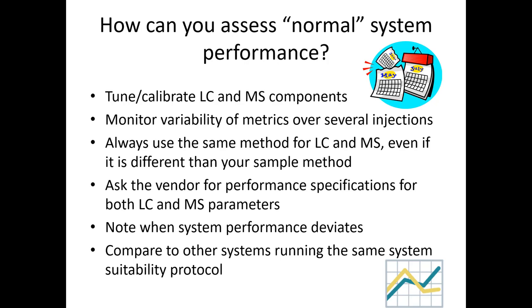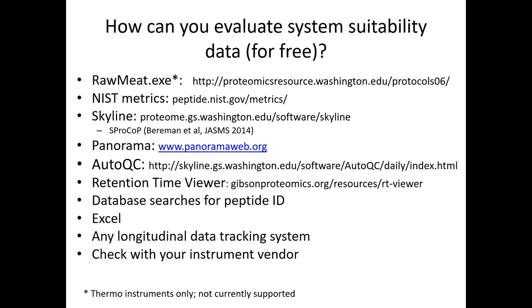And again, who here runs a Q Exactive HF? Okay, look at each other, talk to each other later about what system suitability stuff you've run, and then go back home to your labs and run them, and then talk to each other and ask, what did you get? Because you should be getting the same thing, right? Even if the chromatography is a little different, the performance of the mass spec should be very, very similar. And so if you don't have 2 QE HFs in your lab, make a friend here, and this applies to SCIEX, of course, too, and Waters, and all the other ones.